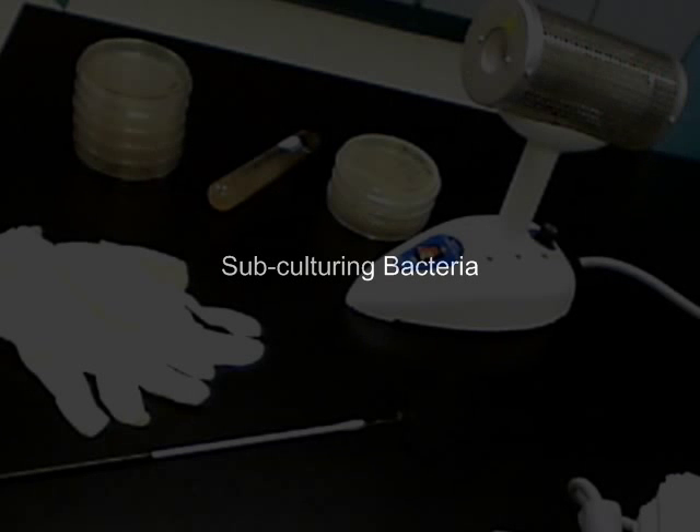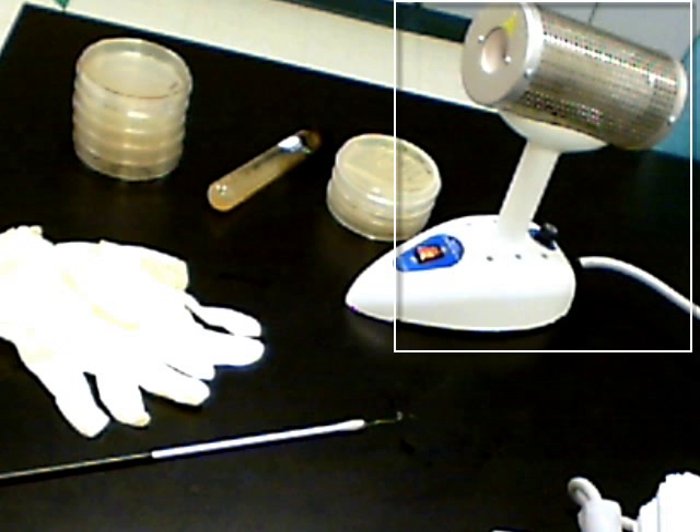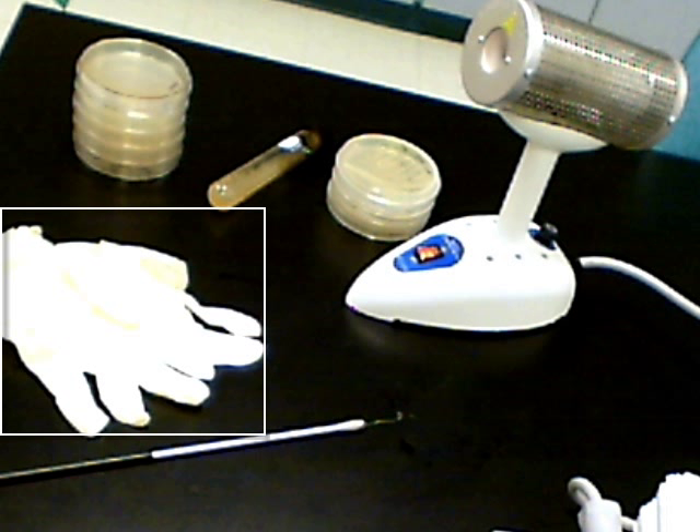In this exercise you will observe how to subculture bacteria from your original stock. Recall that our stocks of Agrobacterium were received in vials that were freeze-dried, and after they were rehydrated they've been cultured on agar plates. About every two to three weeks they need to be subcultured. For this we will need a loop to transfer the bacteria, a bacti-cinerator which glows very hot on the inside and is used to surface sterilize the loop, the original stock, fresh medium to transfer to, and if you want, a pair of latex gloves to wear just for your own protection.